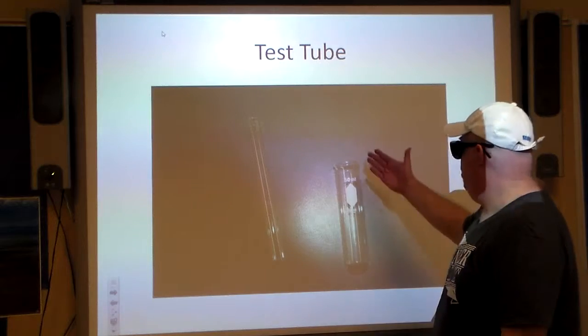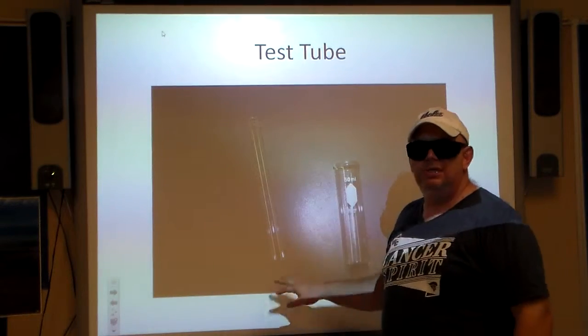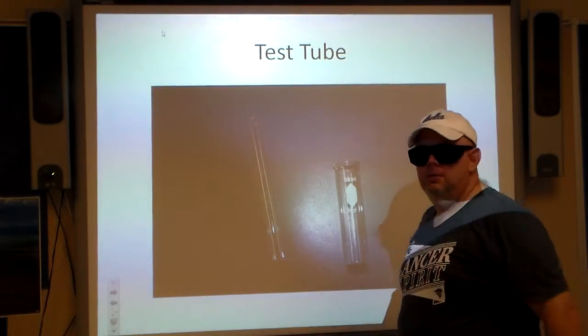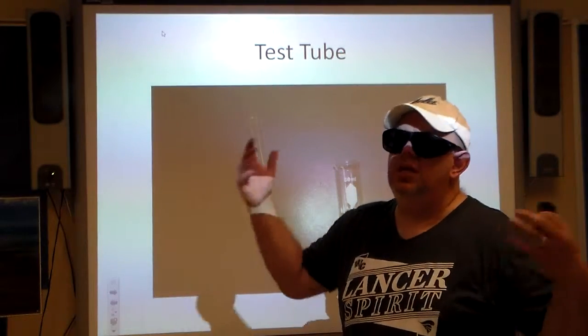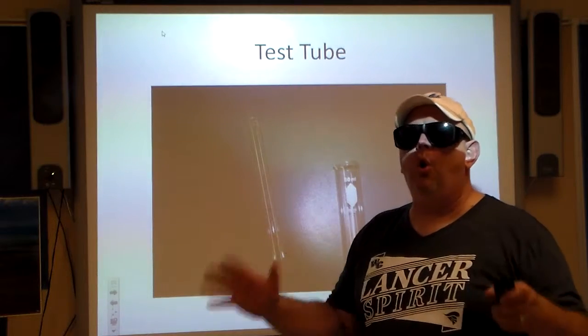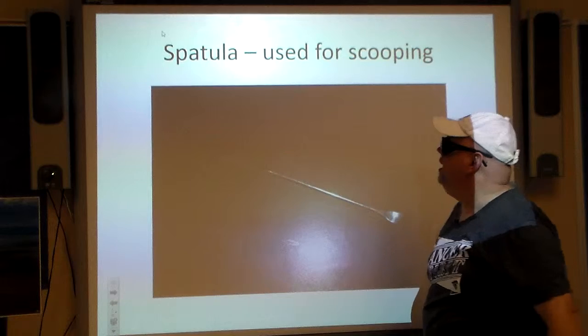The test tube. They do come in different sizes — you've got your long slimmer ones and then your shorter wider ones. It depends on what you're using it for. Some of the test tubes are used to really heat things up, and others are just meant to hold stuff.